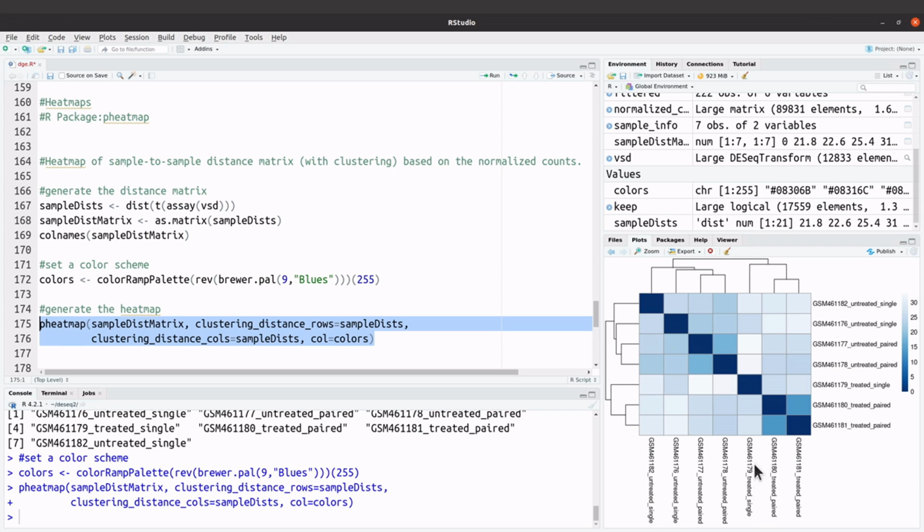Okay, and some two are very dissimilar. For example, this one here and then this one here. Okay, so this one again, this one and then this one, they are very dissimilar. Okay, because when you look at the color, it's in this region. Okay, so having this image here helps you to get a general overview of the similarities. That can also help you to tell a good story. It can help you to interpret the data that we are dealing with. So these things, you have to do them because with gene expression data, there is a lot of exploration, and that exploration that you do will reveal the insights, and these insights will help you to answer your biological questions. So that's what we have.